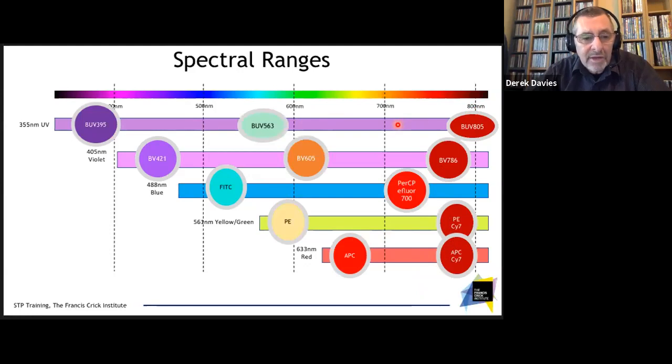We're not taking into account any antigens at the moment. The only slight worry I would have with this is, remember I said earlier on that all fluorochromes can potentially be excited by all laser beams. So one thing I always look at is this.